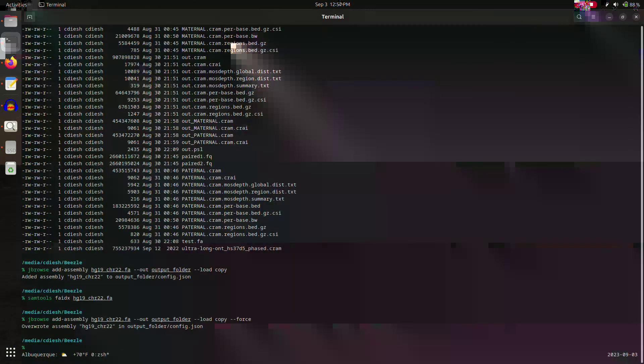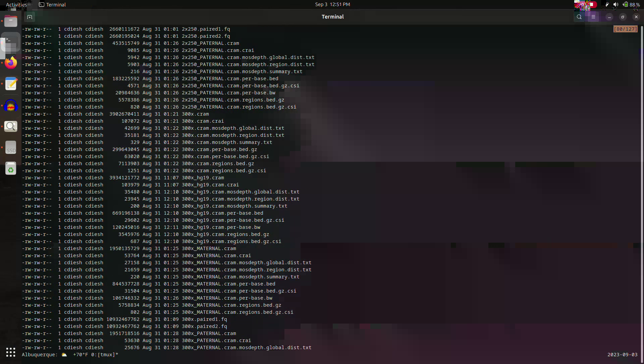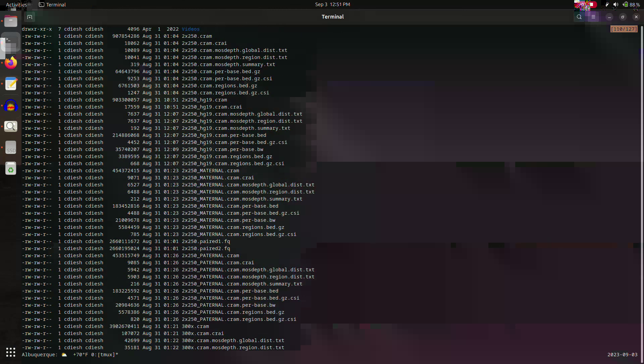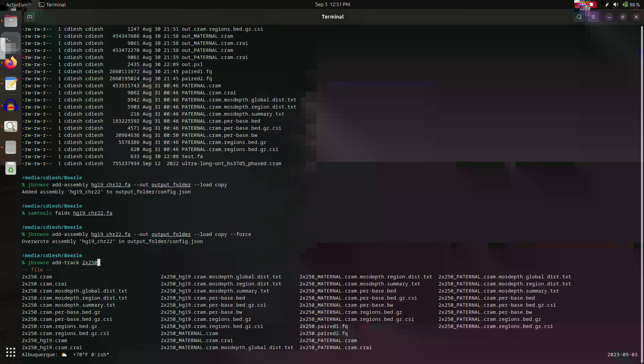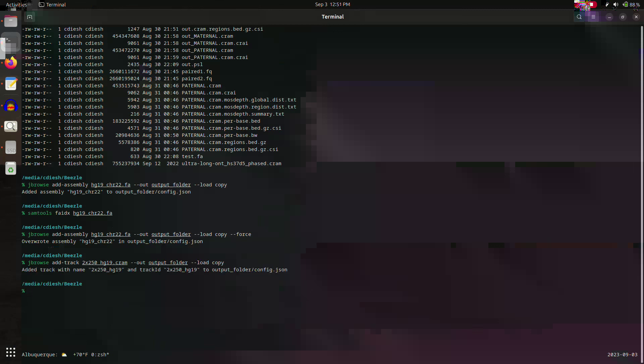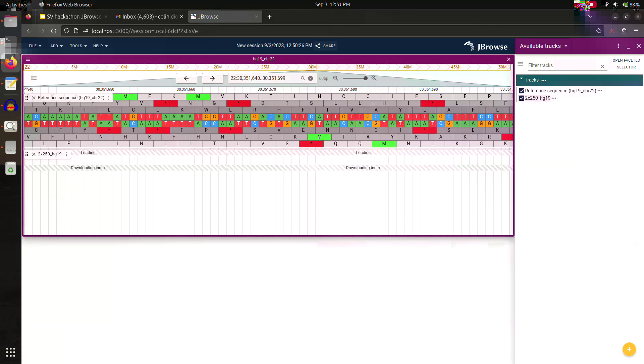Now we're going to try to add some tracks as well. We created some next generation sequencing alignments. We aligned some Illumina reads to the HG19 assembly in CRAM format. I'm going to use the add track command this time with the file name for my CRAM file and send that to the output folder. I'm going to copy the CRAM file there. Here we are. You can go back to my browser, refresh, and now I have a new track. There's my reads. Excellent.